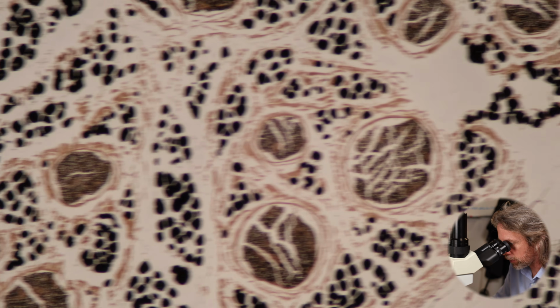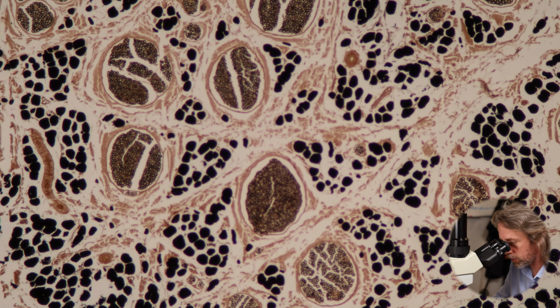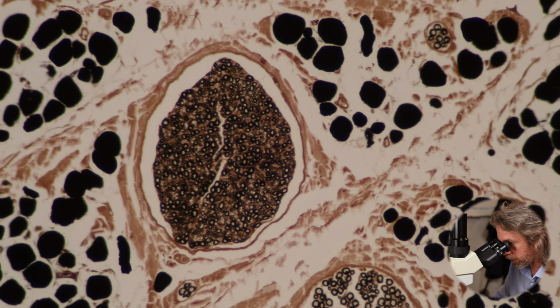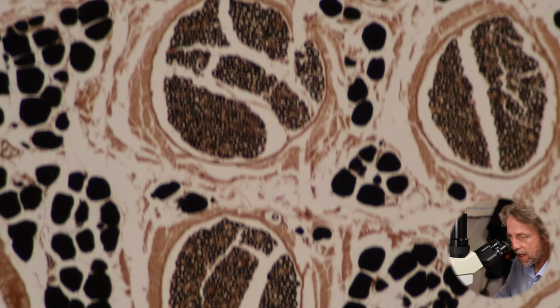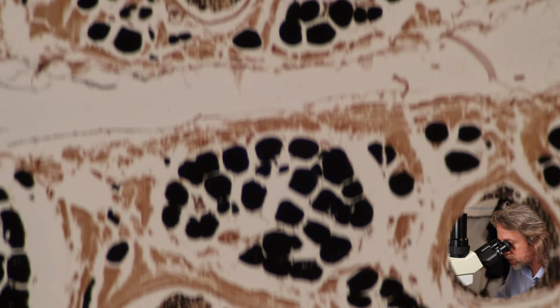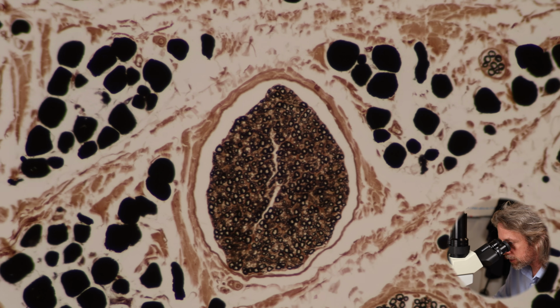Well, we're looking at a lot of fat, obviously, but let's find a nice one. A lot of these cracks that we're seeing here are artificial. They've been caused by, like that sort of shape there, these cracks. These are artifacts of preparing the section and sectioning and that sort of thing. But that's a pretty good one. There we go. Let's zoom into this one.